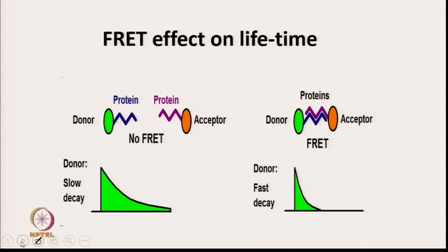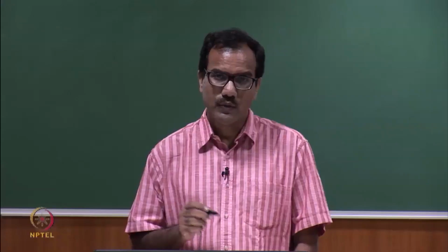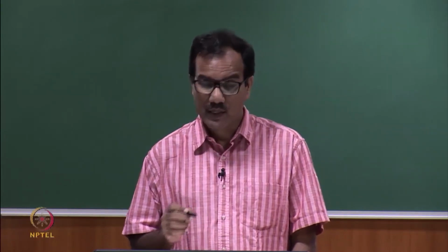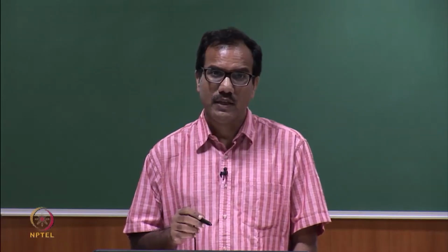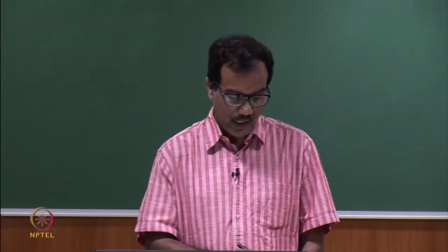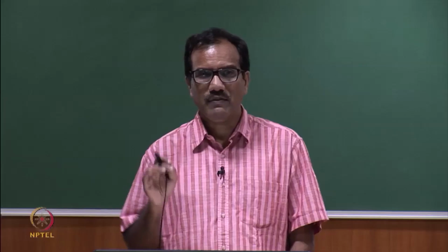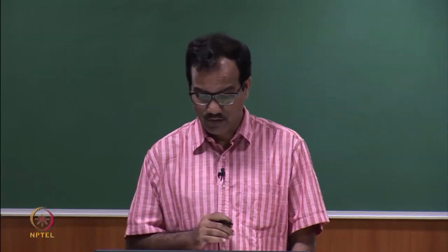So, what is the FRET effect on lifetime? If there is no FRET, then donor undergoes slow decay. When there is FRET, donor undergoes fast decay. So, just by looking at the lifetime, you can know whether interaction between two proteins is taking place or not, and that gives you very useful applications. You can even calculate fraction of interacting molecule.